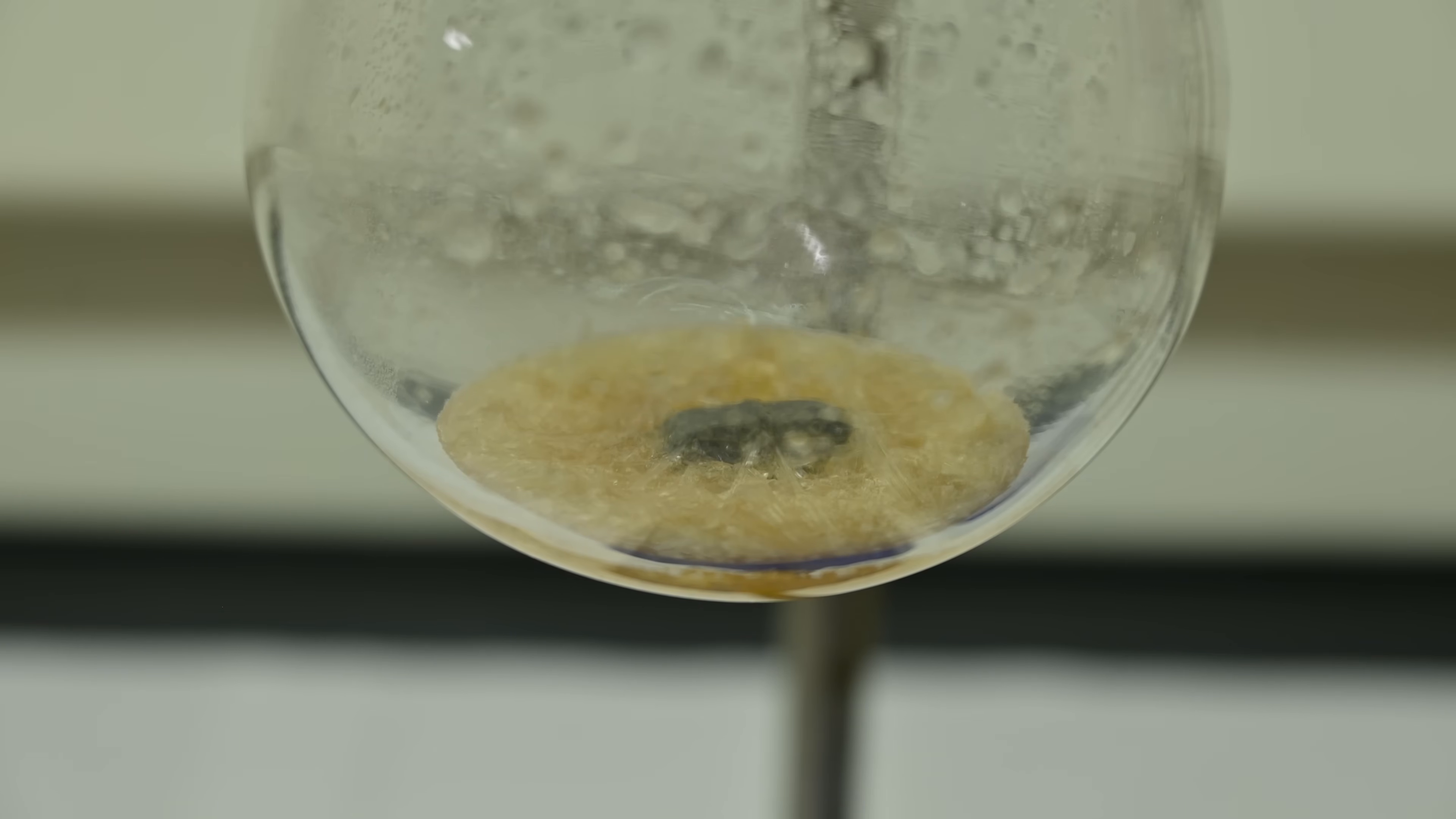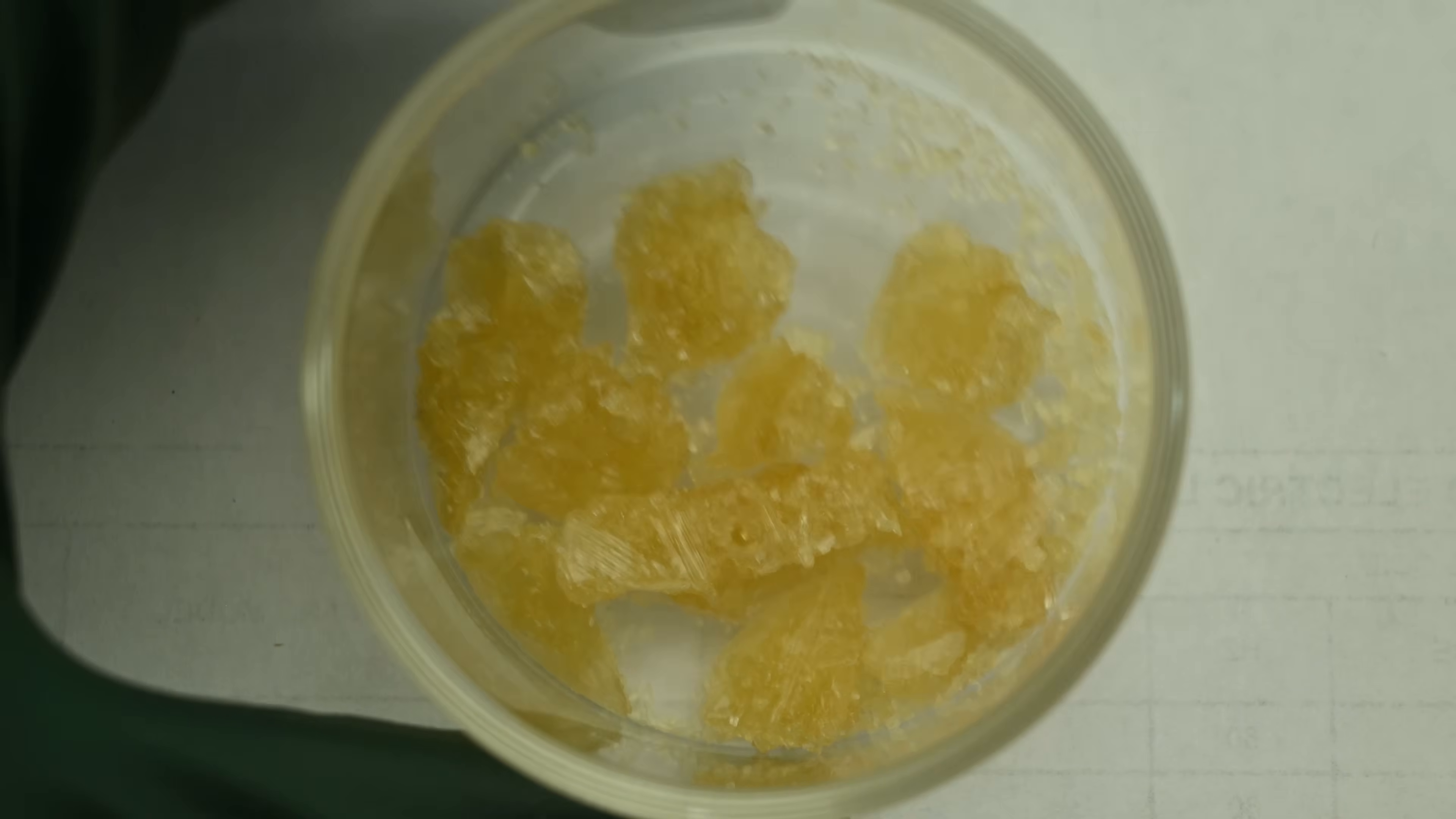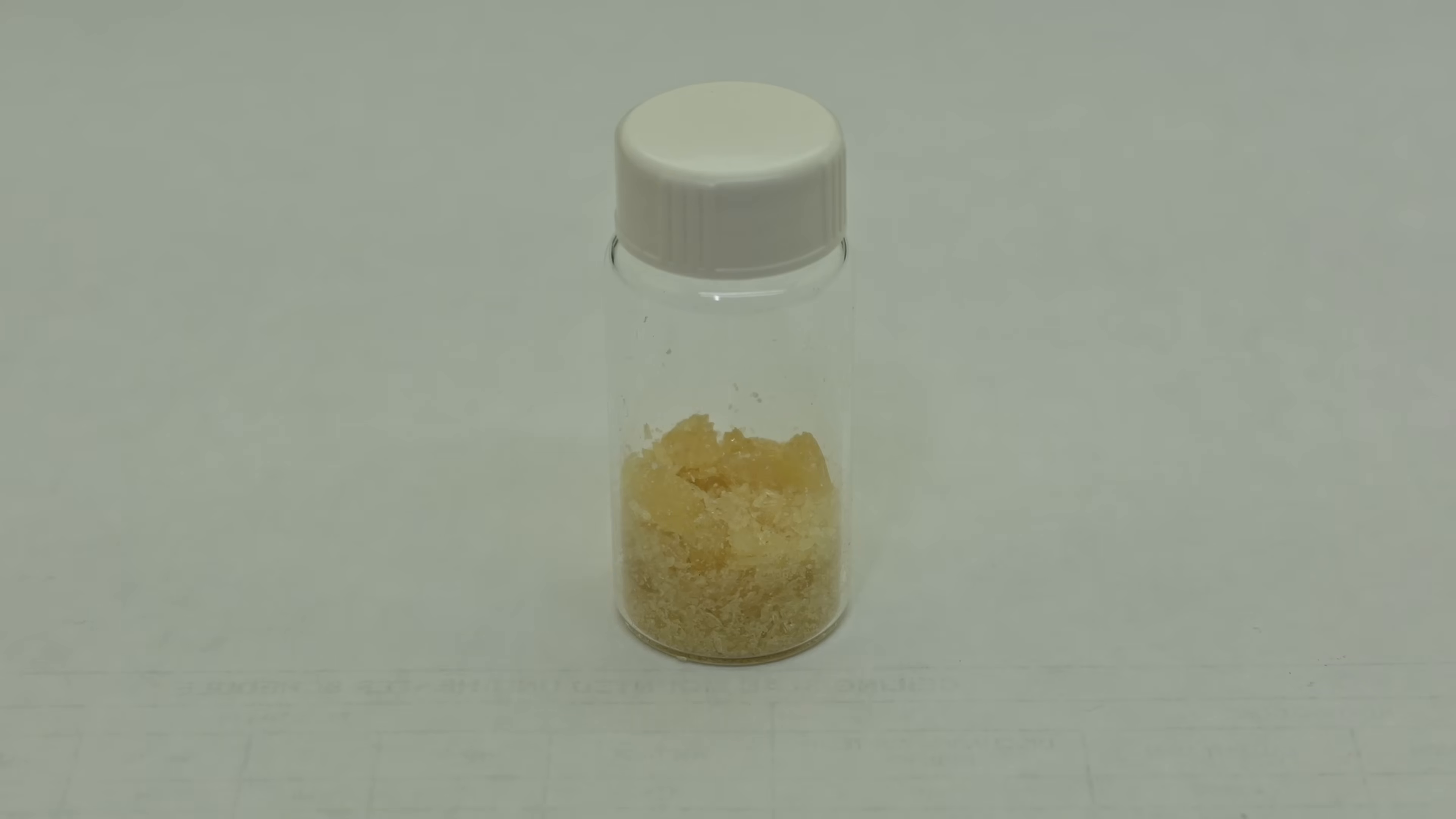I don't bother purifying it since I don't need it all that pure for the next steps. I simply scrape out the solid product which yields just over 6.4 grams of P-nitrobenzoyl chloride, ready for the next part of the reaction.